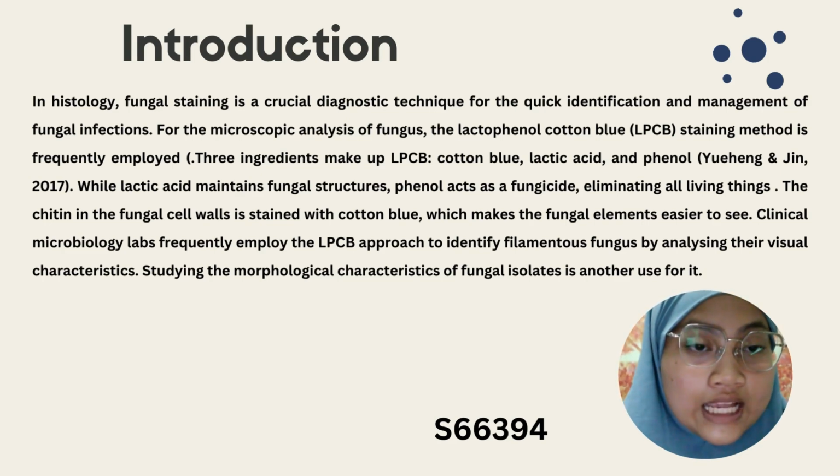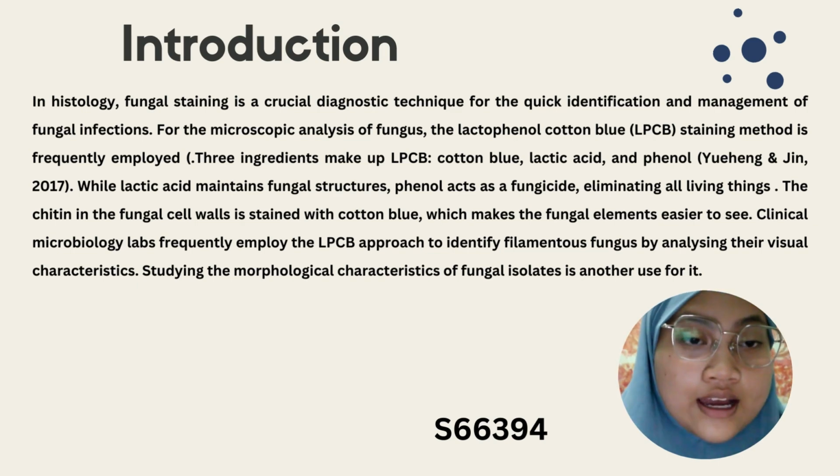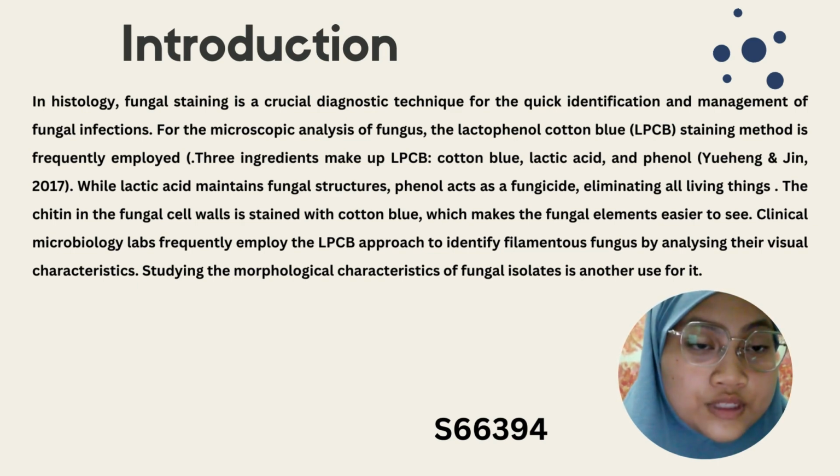LPCB is made from three ingredients, which are cotton blue, lactic acid, and lastly phenol. All of these three ingredients have their own function. Clinical microbiology labs frequently employ this method to identify filamentous fungi by analyzing their visual features.